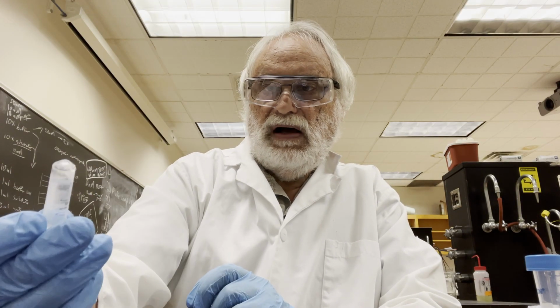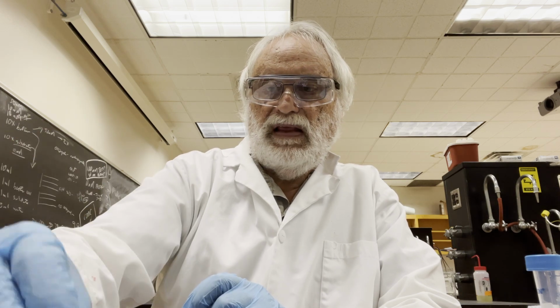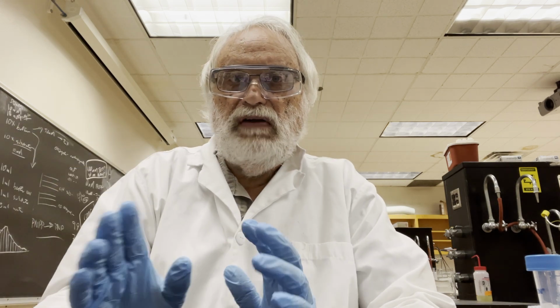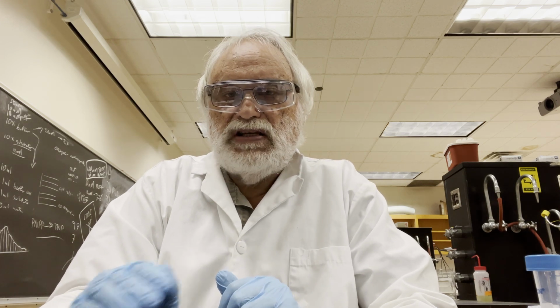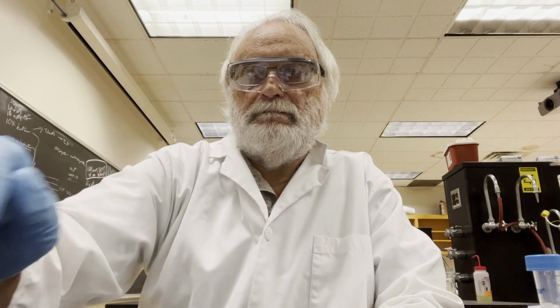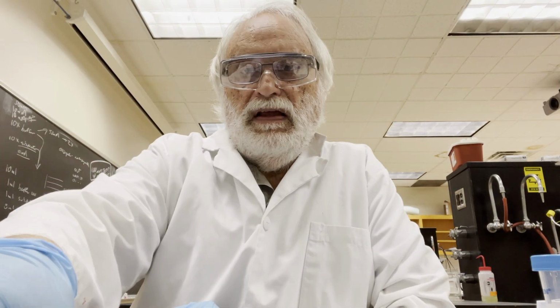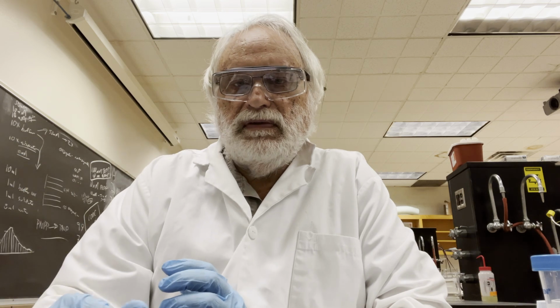Looks like my enzyme is not quite thawed out, so I'll go ahead and stop now, and we'll wait a few minutes until this tube is thawed, and then we'll set up our plate. I'll be back to you in a few minutes. Bye. Okay, everyone. The enzyme samples I have, both of them, have now thawed out.